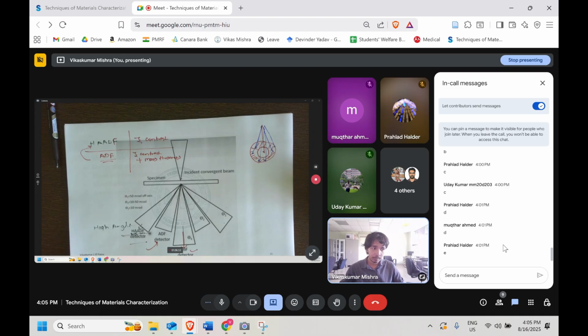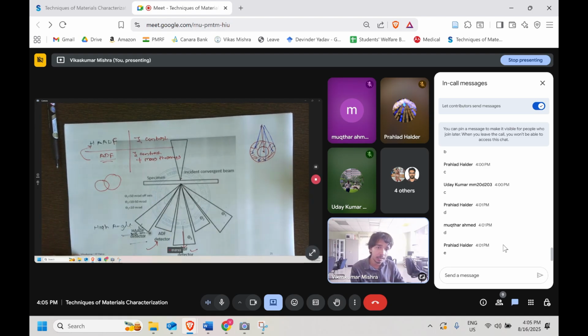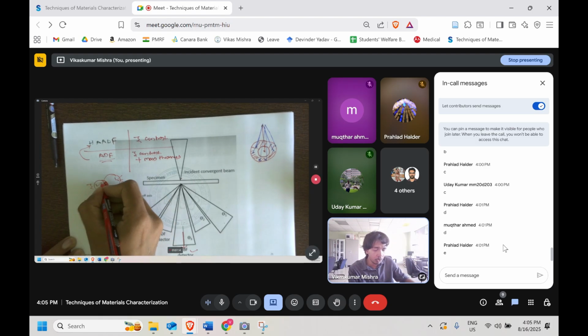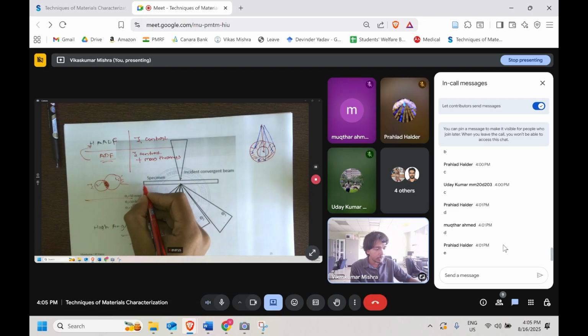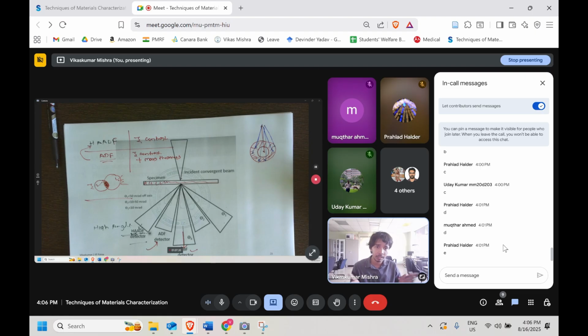One thing is that a thickness contrast will be there a little bit. The thickness contrast will be there because, let's say, one grain having the higher Z is overlapping with another grain having the higher Z. Both have, let's say, the same Z. Now if you project, this particular region will appear brighter compared to this. These two also will be bright, but this one will be even brighter, because we know in the TEM the information we are getting is the projected information, throughout the thickness of the specimen. So thickness contrast will be there. The mass contrast will not be there.